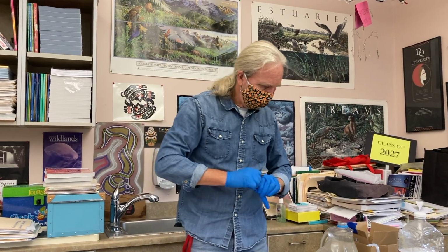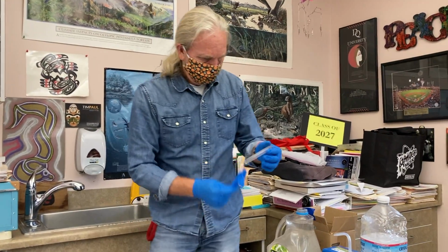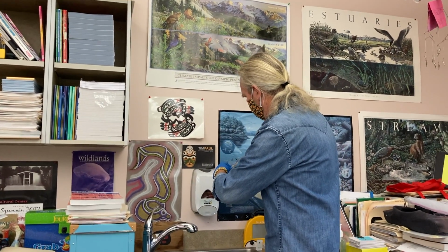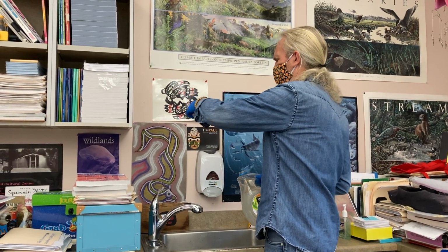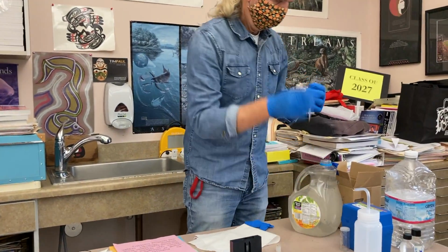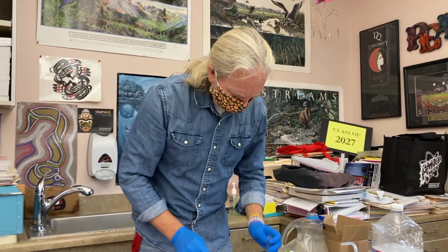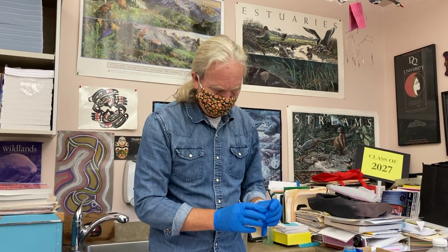We're going to put some water in here, some river water, 5 mLs, which I'm going to have to get off there. Whoops. Back in here. And we have two chemicals, a number 1 and a number 2.